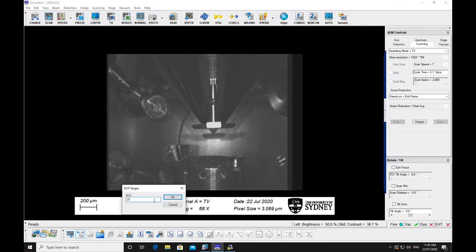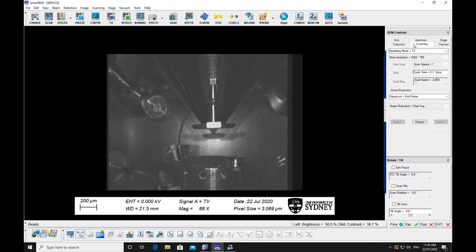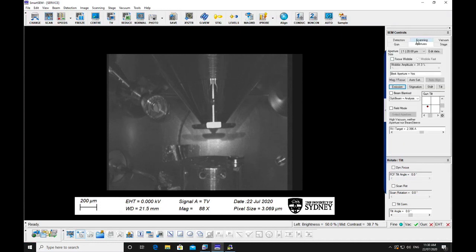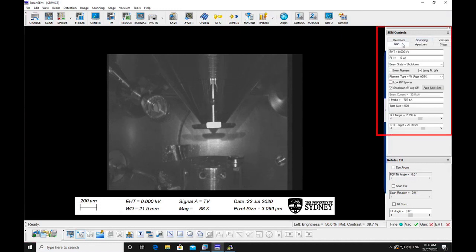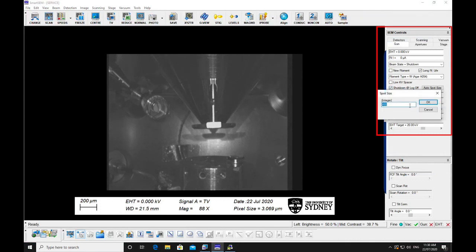Select the accelerating voltage and spot size appropriate for your intended imaging conditions. Smaller spot sizes around 350-400 will give you better resolution but less beam current.